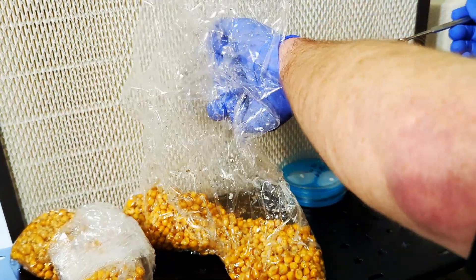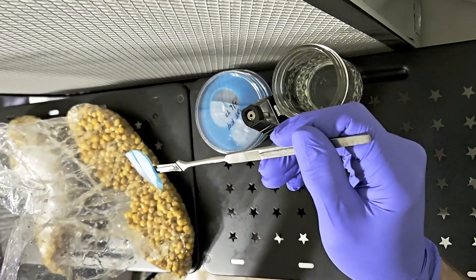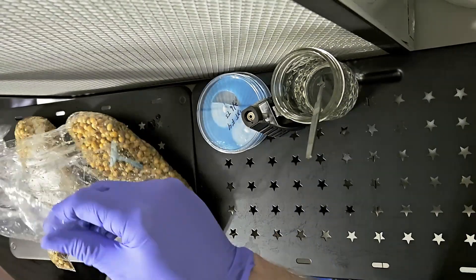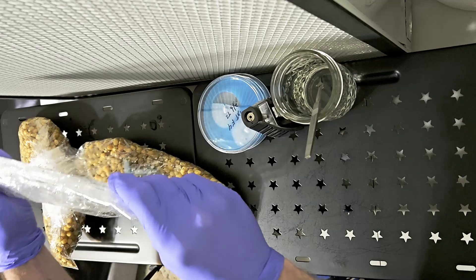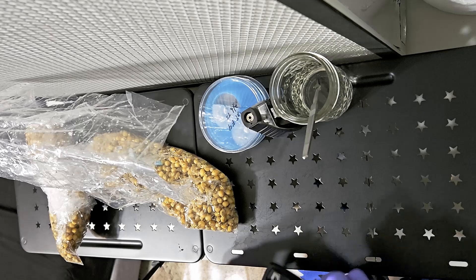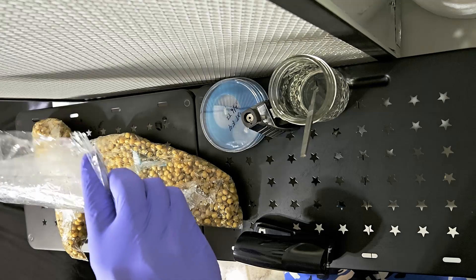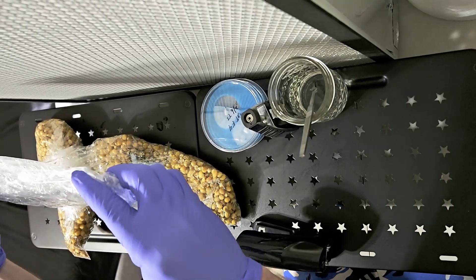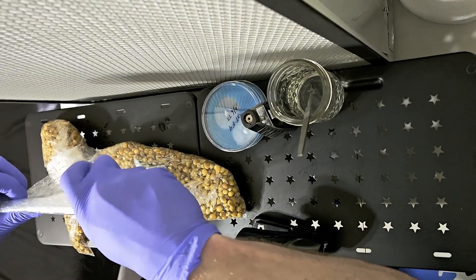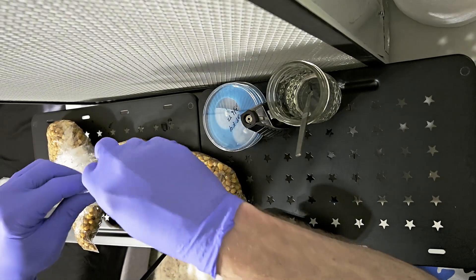Once the bag is open, we want to drop the mycelium into the bag. Try not to let the agar get stuck to the side of the bag; if it does, you can gently flick the bag to get it to fall. If you're doing this in a still air box, perform this procedure as quickly as possible and reduce the time the bag is open. Once the mycelium is in the bag, I fold the top over two to three inches, then fold that part in half, and then fold it once more. I do this to make sure there is as little air exchange as possible. There is enough oxygen in the bag to last through the colonization process, as long as you don't use too much grain.